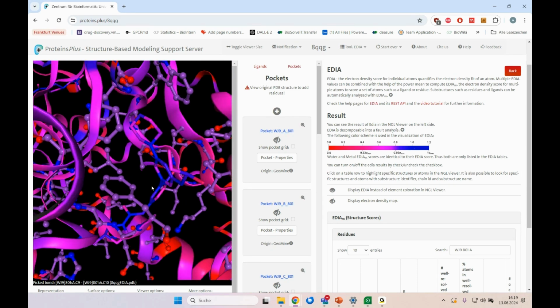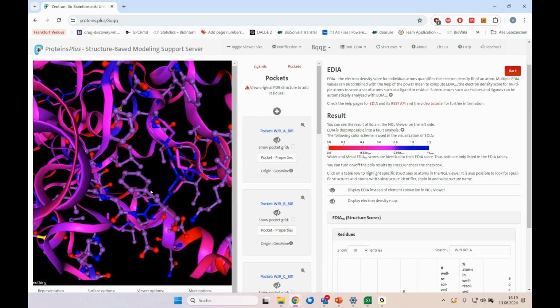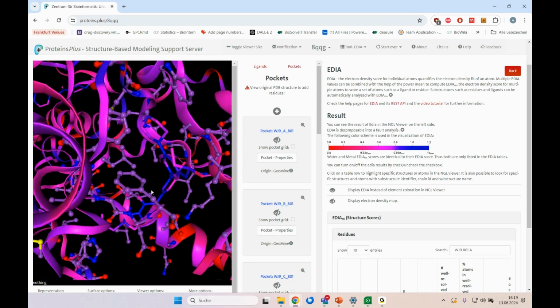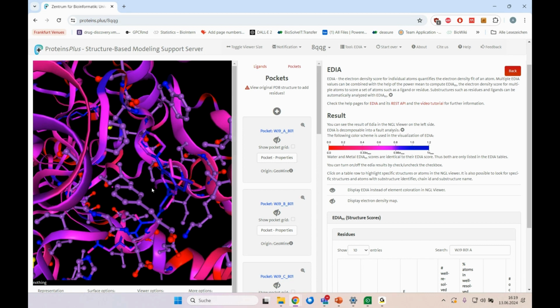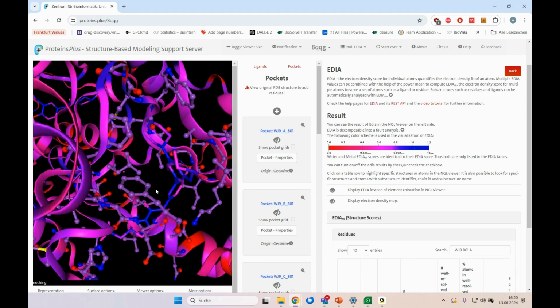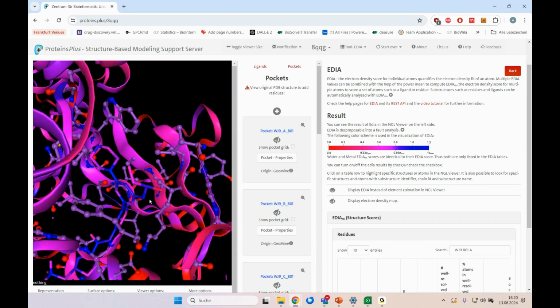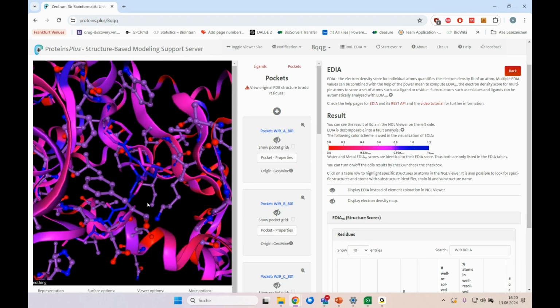So you might now, if you had more time than we have now, compare this also with the chain B and chain C analogs to see whether something may be much better justified, let's rather say, instead of resolution, because the resolution is slightly below 3 angstroms, I think. But the resolution only tells you half of the story. The other thing is, is there enough density for the region of interest? So just so that you know, it's an open server, costs you nothing, but careful, if you have proprietary structures, then this will require extra work, for example, porting something like the EDIA server machinery into your organization.